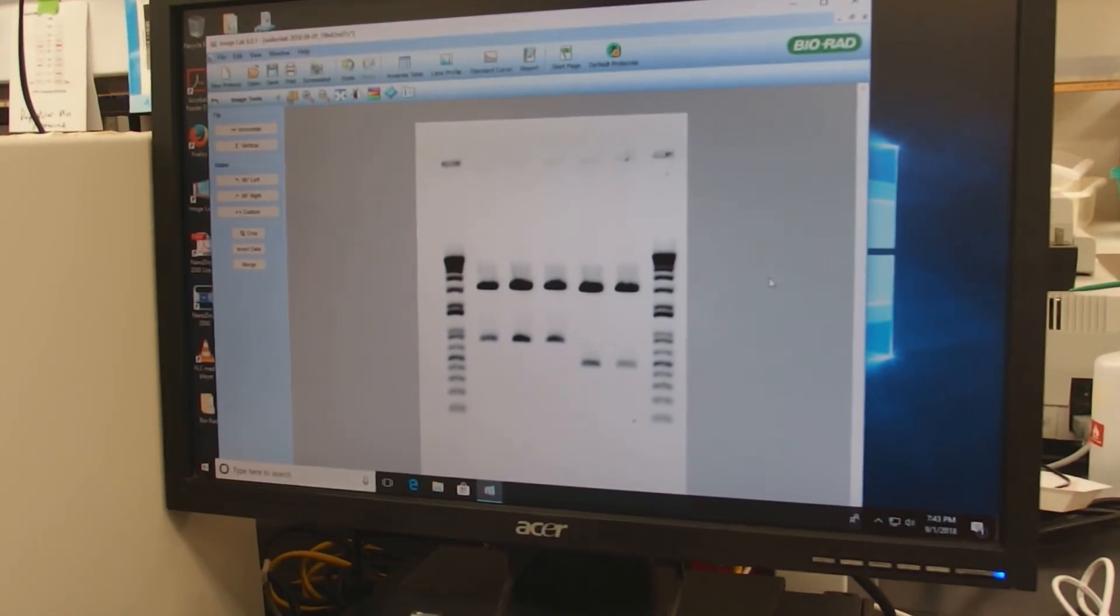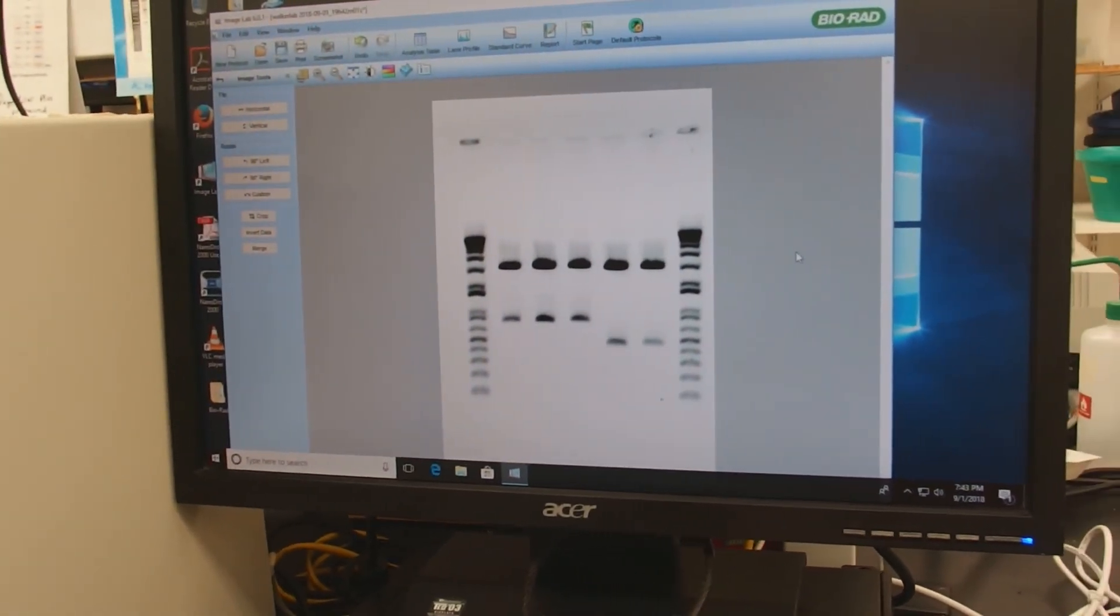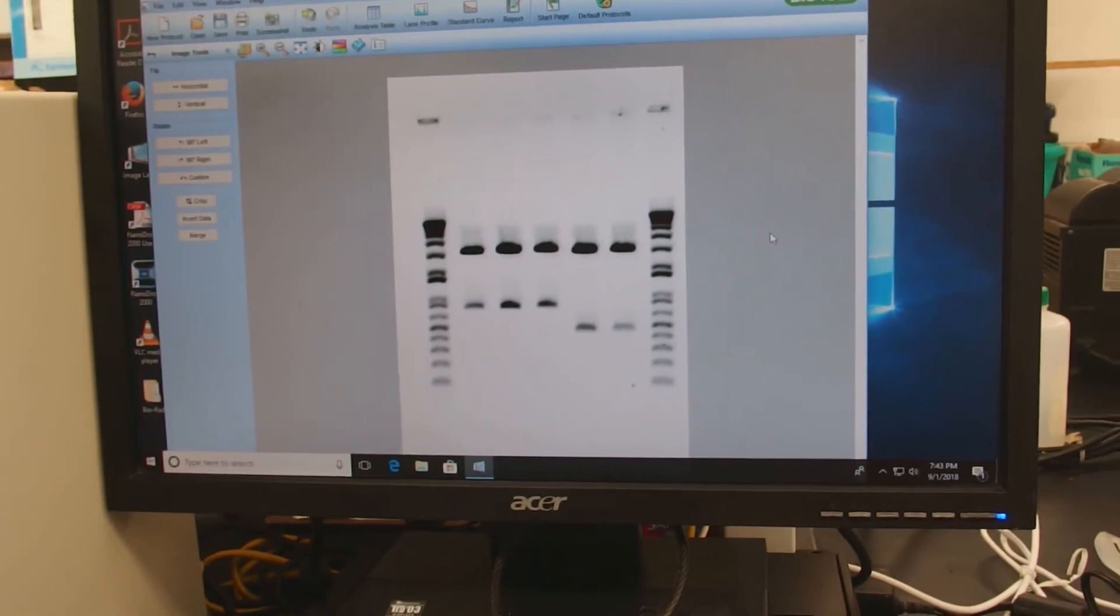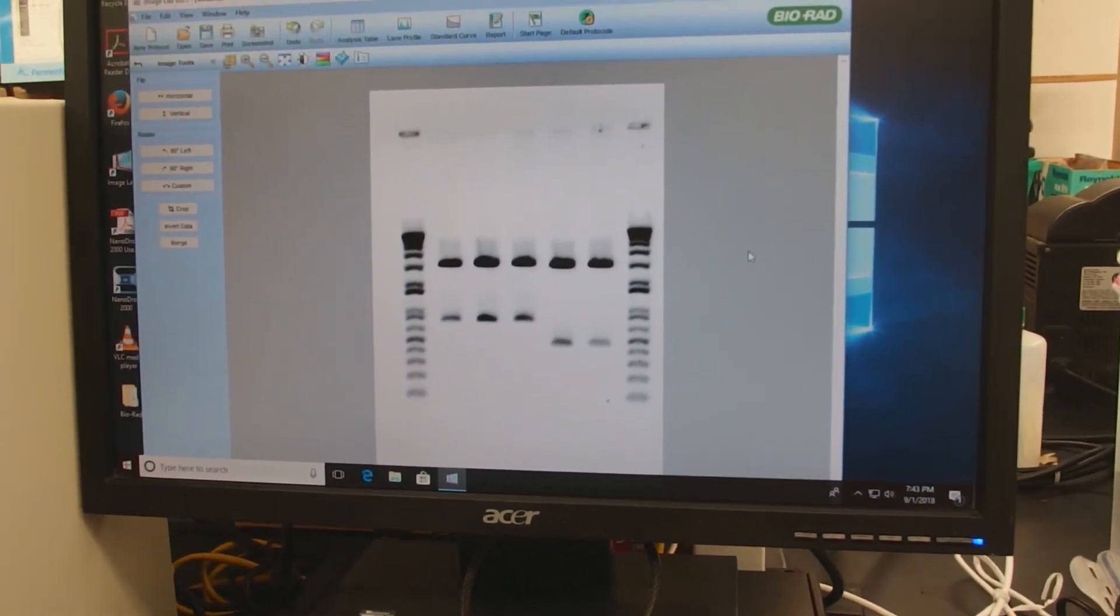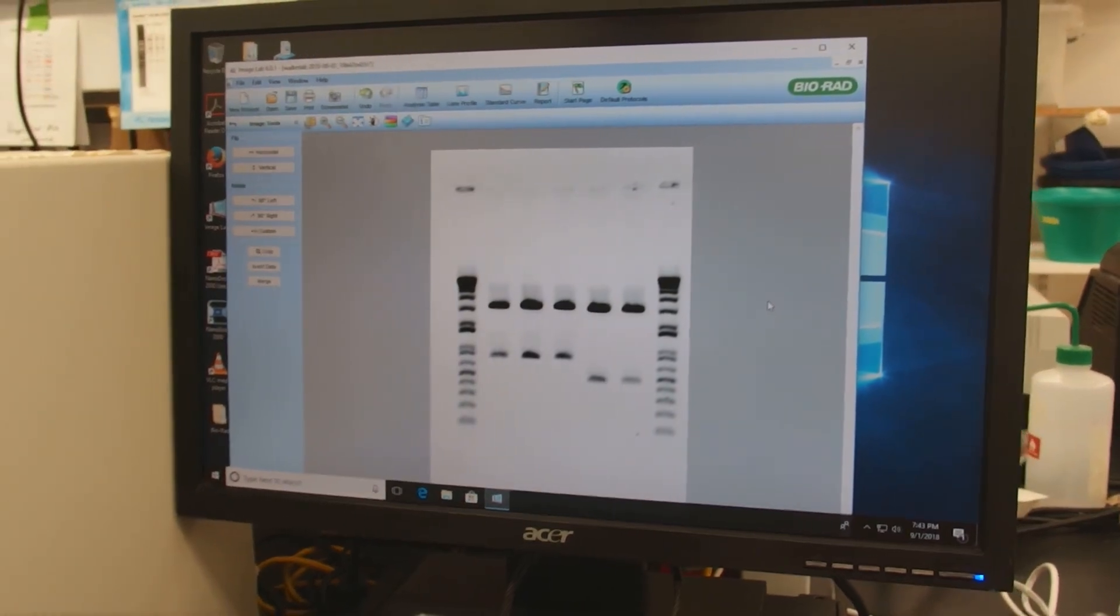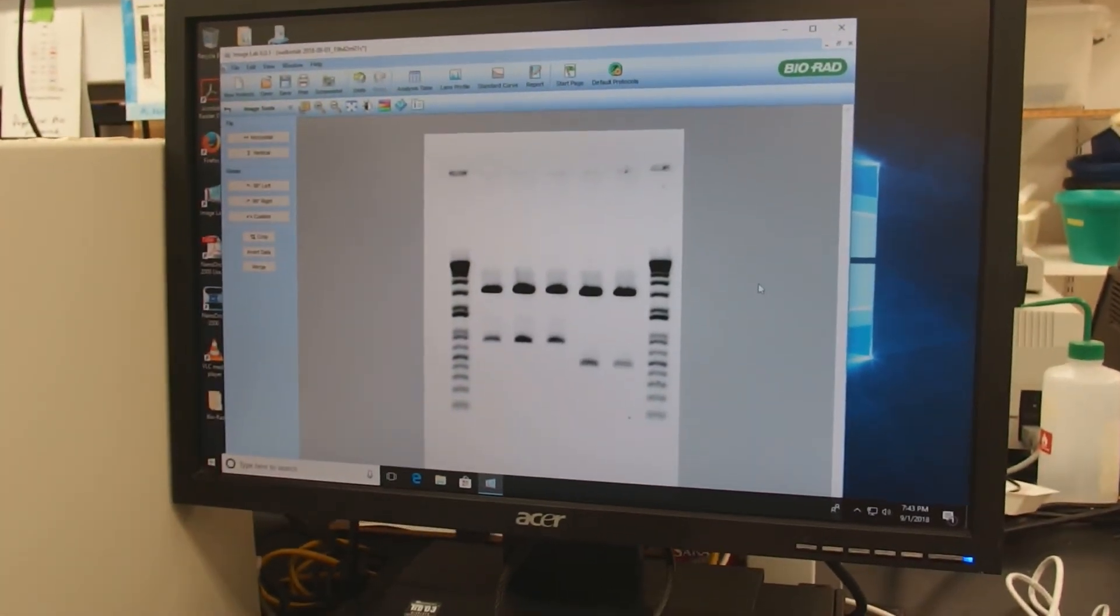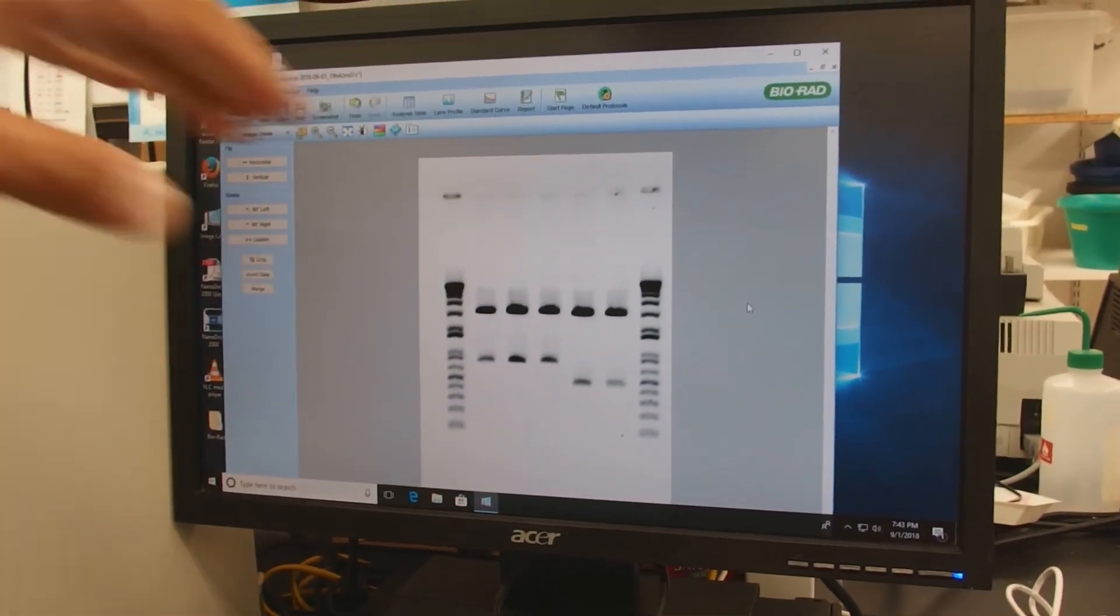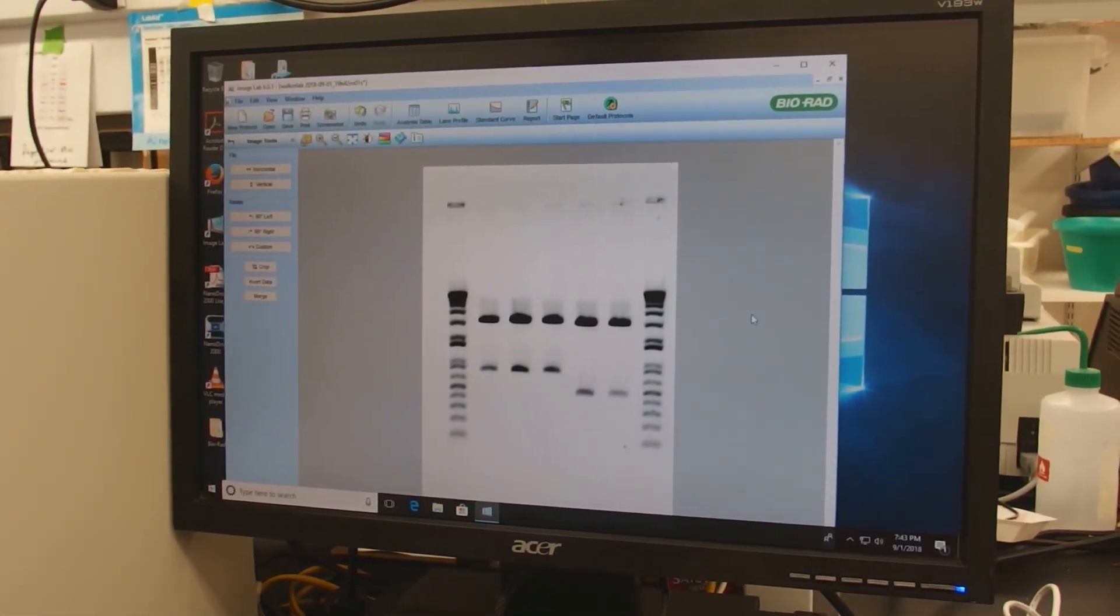So this is our gel finally imaged. You can see that even when we run the gel at 300 volts for seven minutes, we get very nice resolution of the ladder and the bands. The 1KB plus ladder is resolved very nicely and we get very sharp bands.